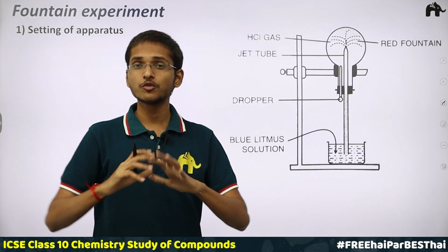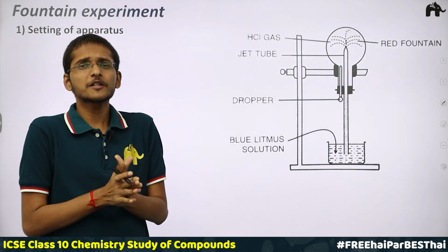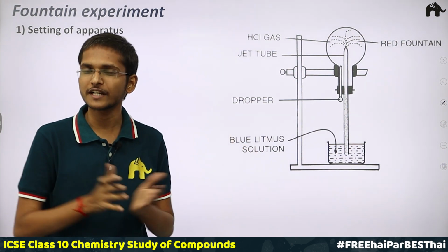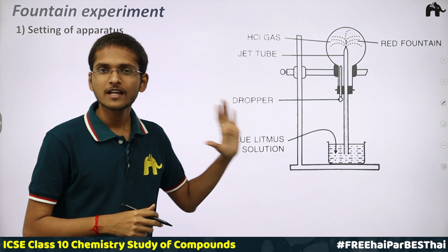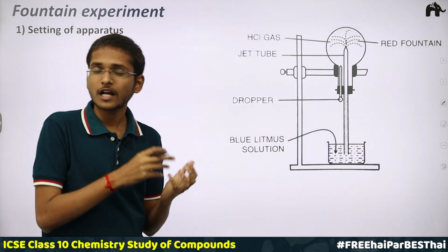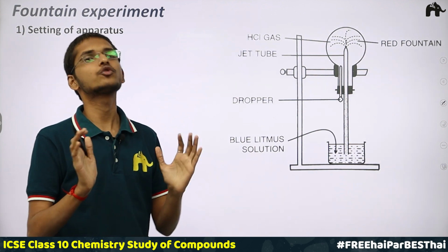So neither is HCl playing the role of a combustible gas, nor is it playing the role of a supporter of combustion. Now moving ahead to another interesting experiment, the fountain experiment. The name of the experiment itself is very interesting, right? This experiment will help us understand how hydrogen chloride gas is highly soluble in water.